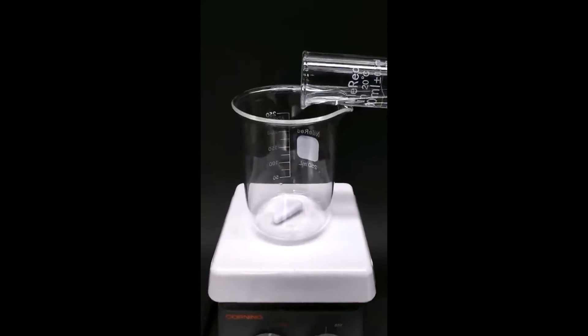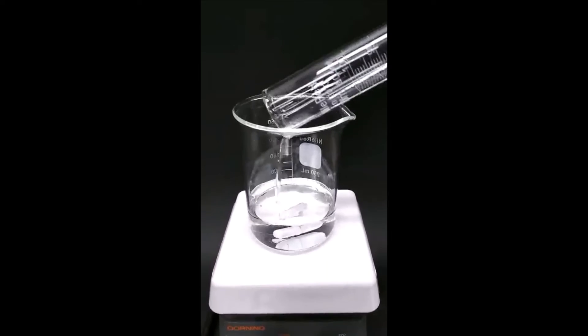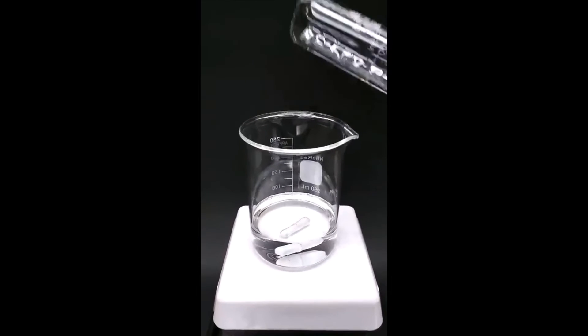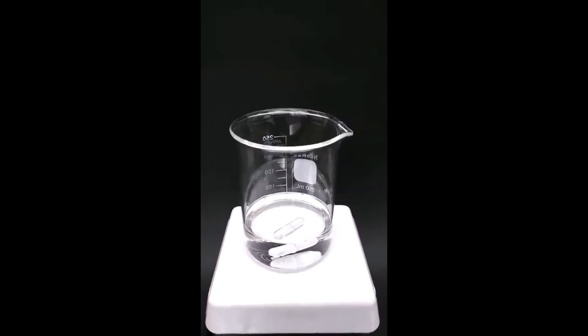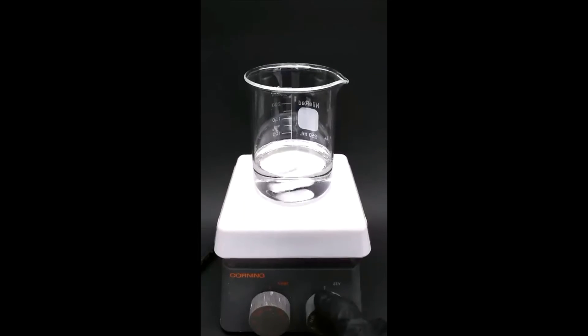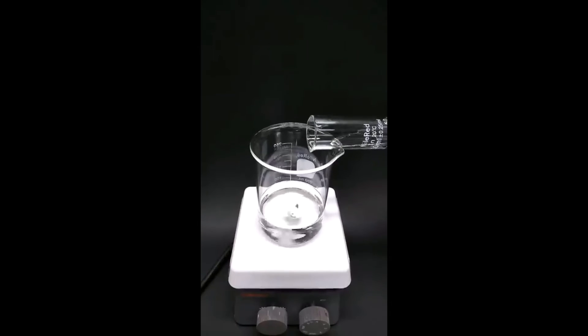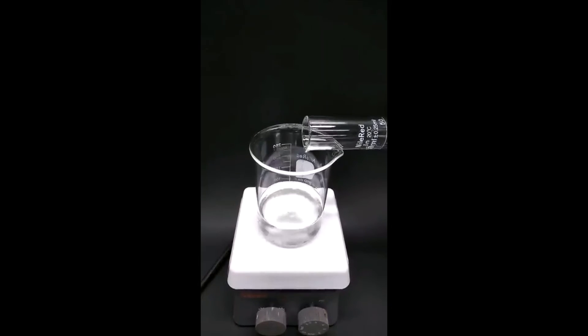So for no reason, I've decided to make some piranha solution, which is probably one of the angriest liquids that you can make in the lab. To do this, I just have to start with some concentrated sulfuric acid and then carefully add 30% hydrogen peroxide.